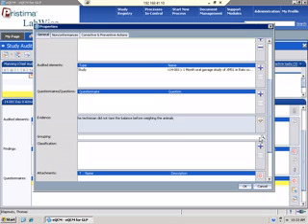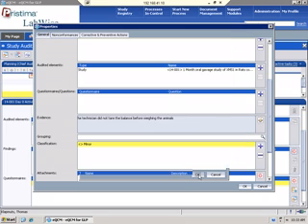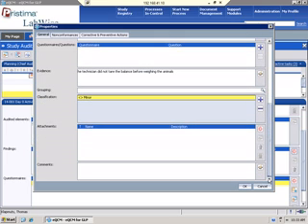animals. Again, if you have groupings of findings, you can add a grouping, classification, minor, major, again, you define all these. And then if there's any attachments that you want to load into the system that, again, is not part of the document management system, if it was maybe a packing slip or a photograph you took or something like that, and then you also have a comment field at the bottom.